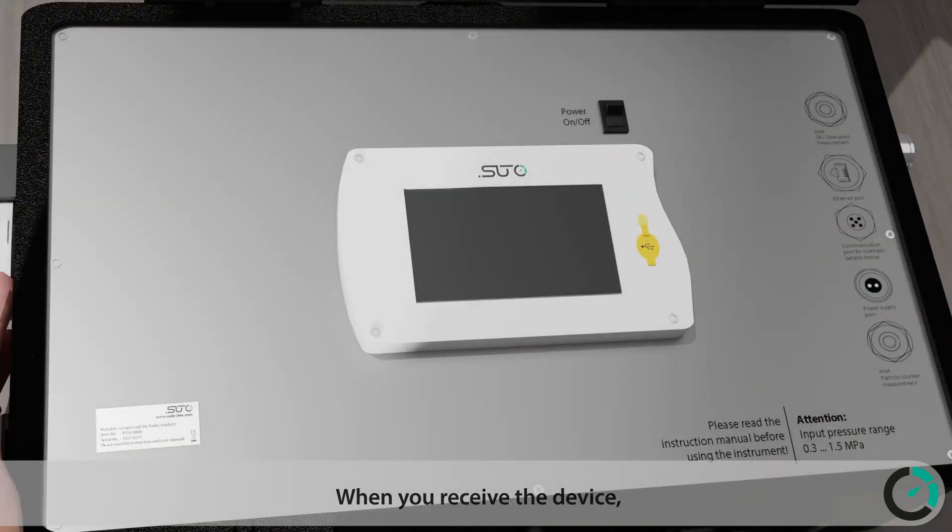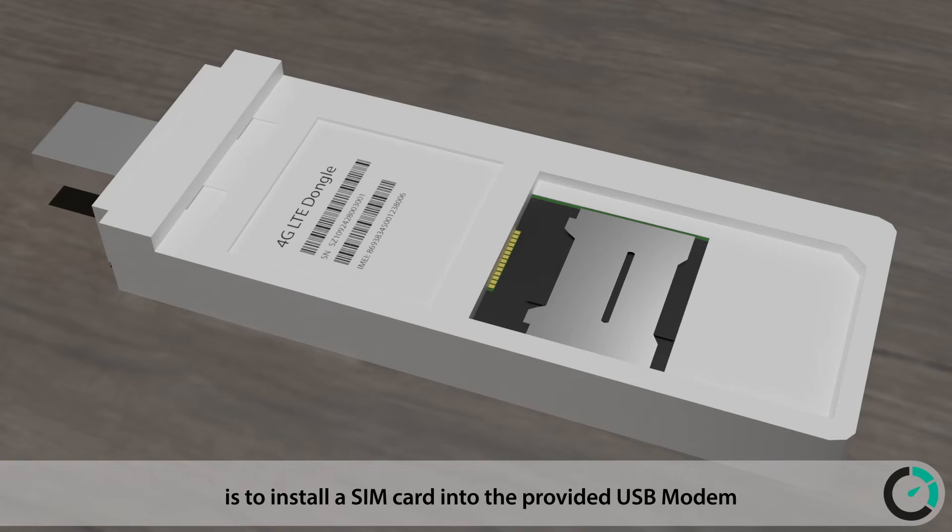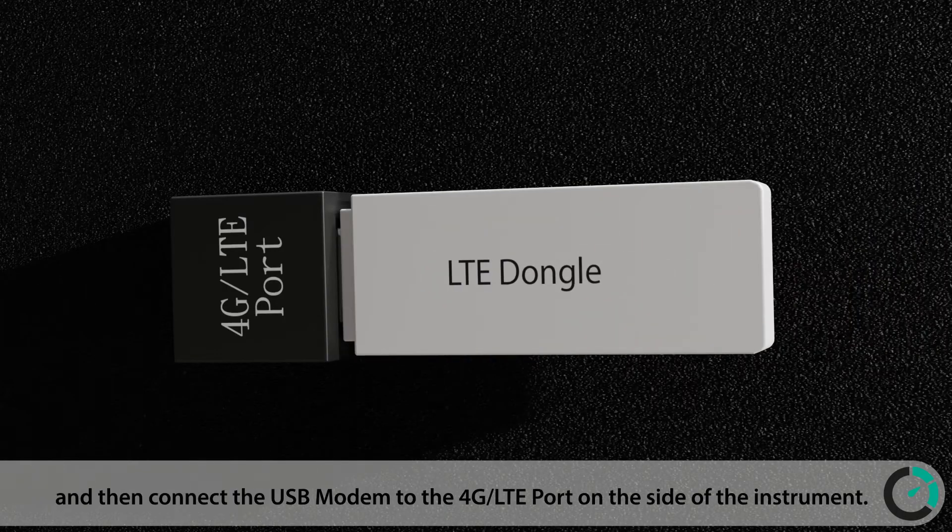When you receive the device, the first thing that needs to be done is install a SIM card into the provided USB modem, and then connect the USB modem to the 4G LTE port on the side of the instrument.